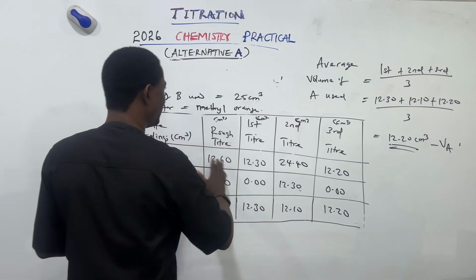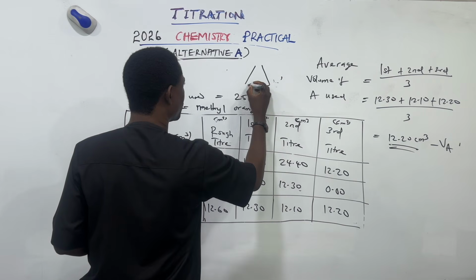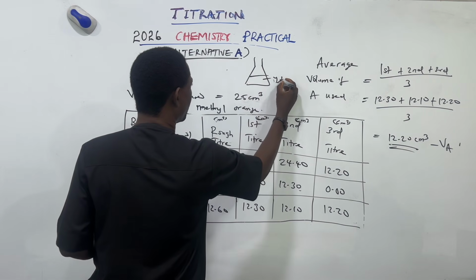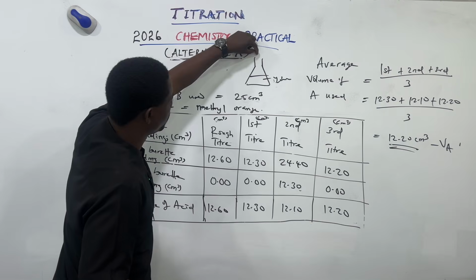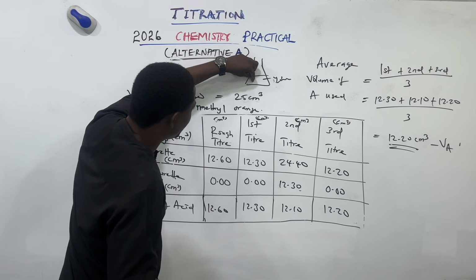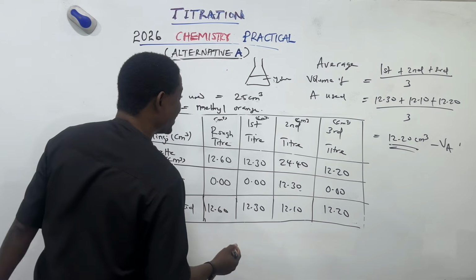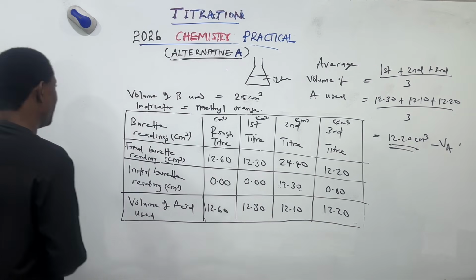You are used to methyl orange: when you put the methyl orange in base, it's going to be yellow. I'm going to show you some video about that. So it's going to be yellow. As you're adding acid, it's picking up the base. Then when the color becomes something like permanent orange, then you stop. But that's not the case when you use phenolphthalein.